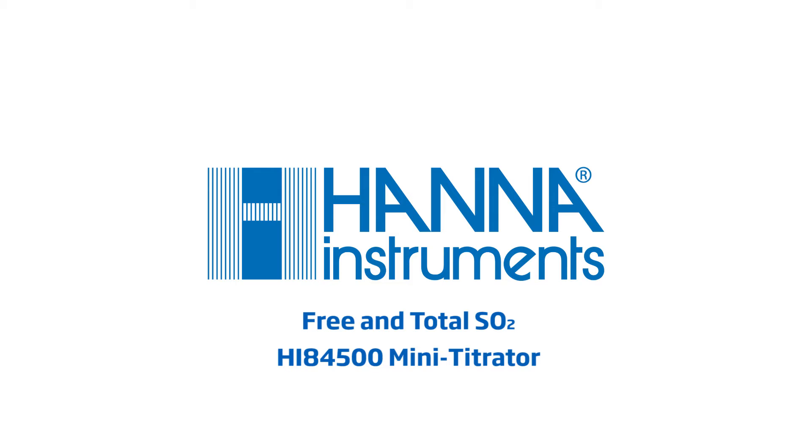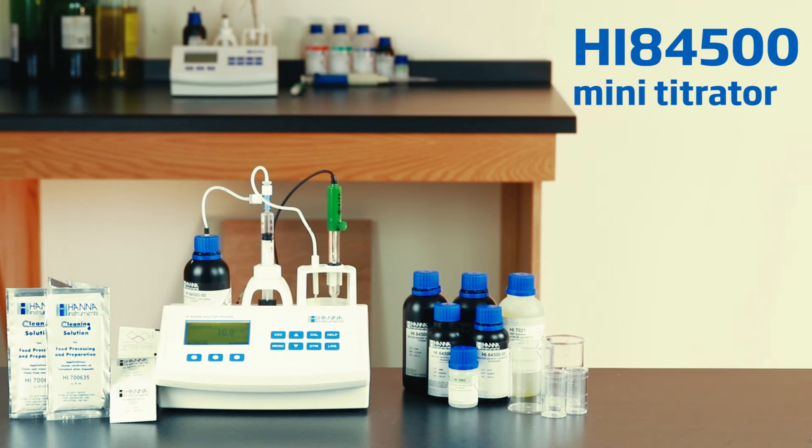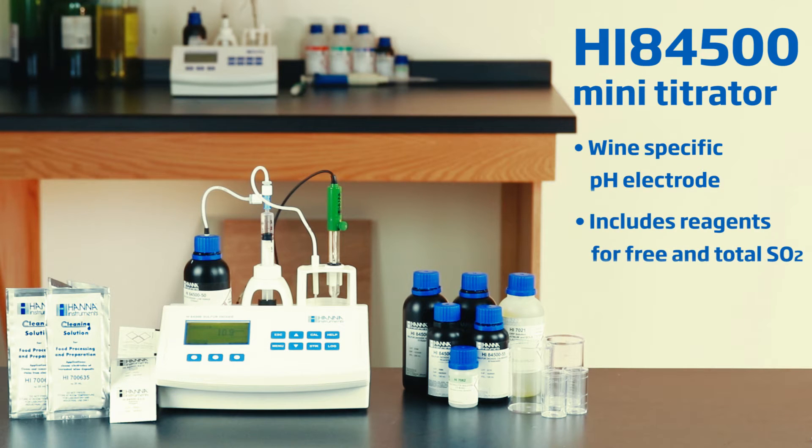Free and total sulfur dioxide analysis in wine is easy with the Hanna Instruments Mini Automatic Titrator for measuring sulfur dioxide in wine, HI84500. In this video we will assemble and prepare the mini titrator for calibration and measurements.